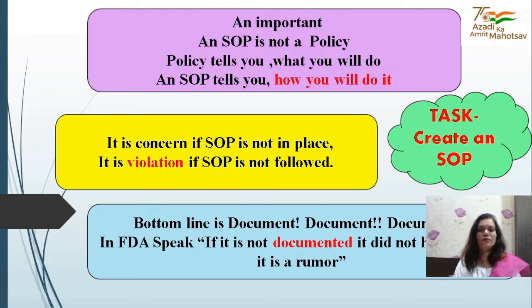And a task for all of you: prepare an SOP for the instruments which you're working on. If any instrument is very tedious to work with, prepare the SOP based on that particular instrument.